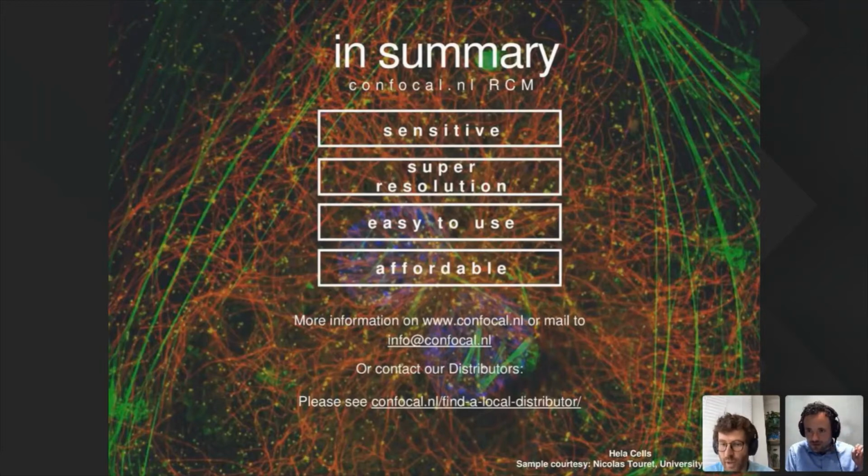So the question was, do we need a true global shutter readout for the camera when using the multi-split? I don't think it would make any difference using or not using the multi-split. No, so our system utilizes either a global or rolling shutter. We send a TTL pulse to the camera. The camera opens and stays open as long as the TTL pulse is high, and then we write the information point by point, line by line, and frame by frame.